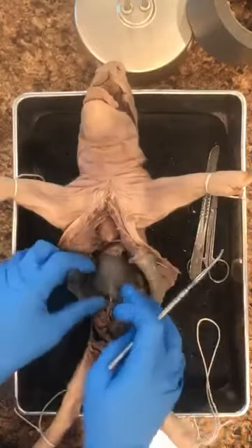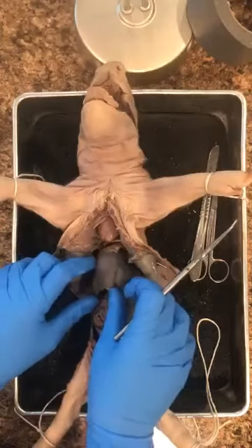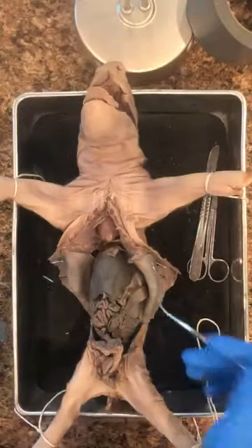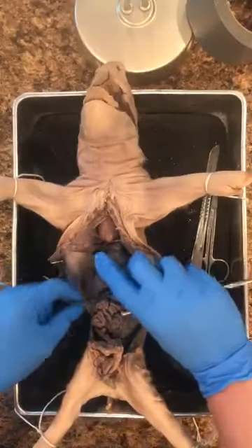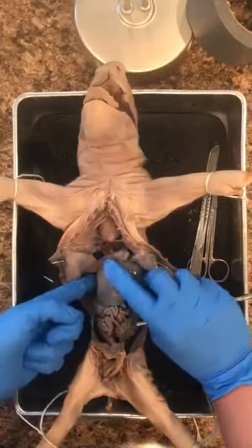So here's our liver, nice and large. It's multi-lobed. This actually not just multi-lobed, it is 5 lobes. So there are 5 lobes to this liver. The frog had 3.